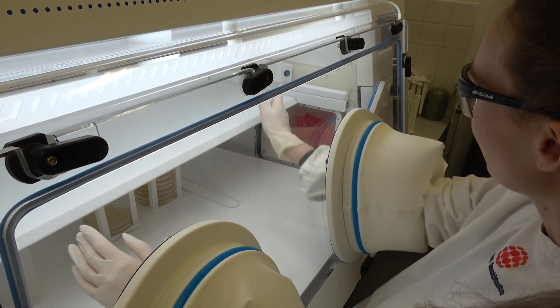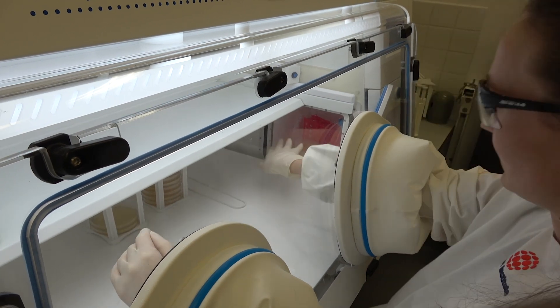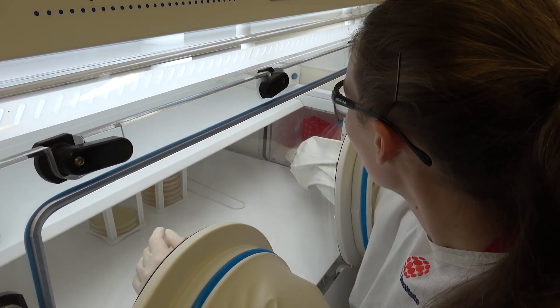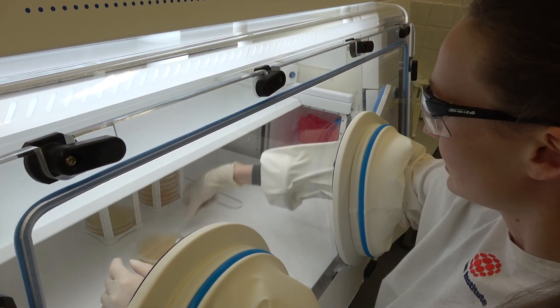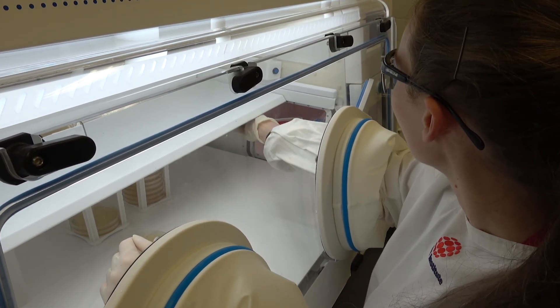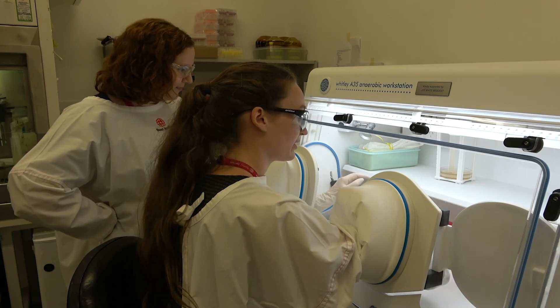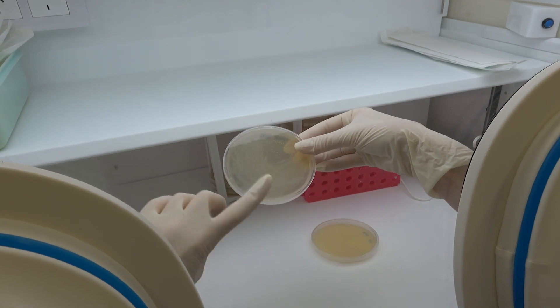Now that I'm inside the chamber, I can open the side door to access the items I put inside the airlock earlier. Some I can reach easily, and some I need to grab with a little tool. At the moment we're growing a few different types of bacteria, which we can grow on plates.